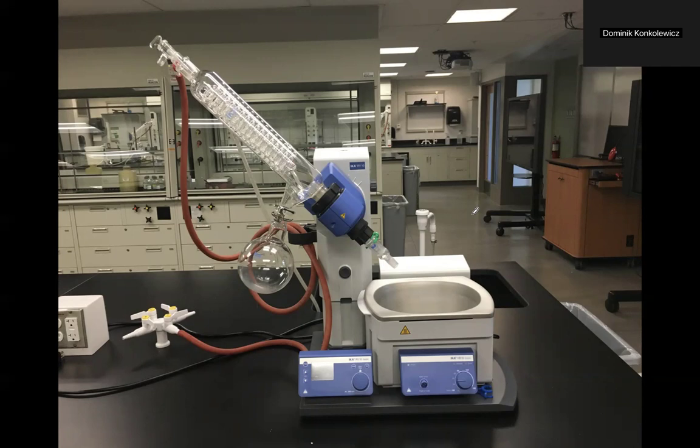We don't actually want the solvent, so we're going to use this piece of equipment here, which is called a rotary evaporator, also called a rotovap, to essentially remove the ethyl acetate solvent. And to make it easier and go under milder conditions, we're going to do it under reduced pressure. So that's what this hose is. This hose runs all the way down here. It is the vacuum hose that puts our system under reduced pressure.